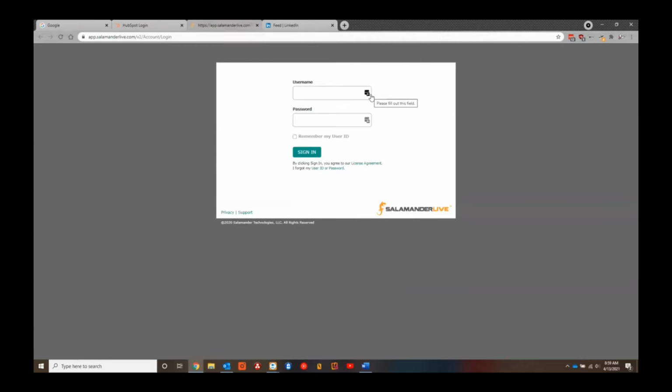The bulk of this system, known as the Salamander system, is funded by the state of Missouri. And so the Missouri State Labs can access this database for little to no cost, literally. And then obviously there's a big need with inventory asset management.